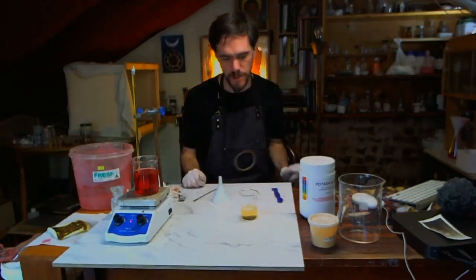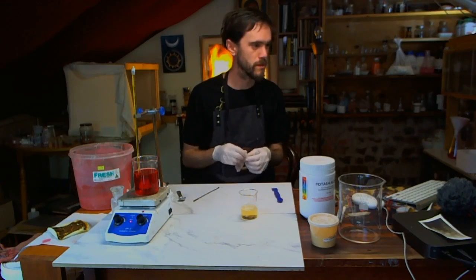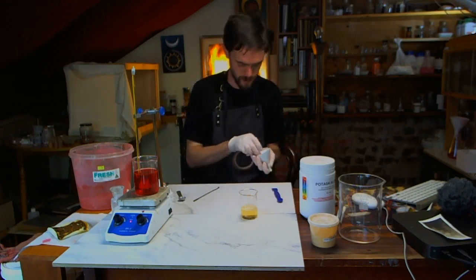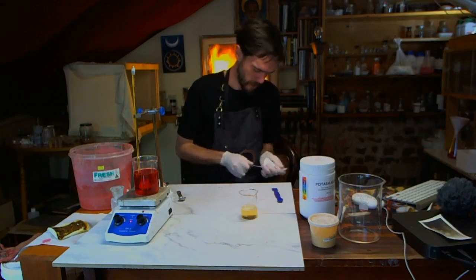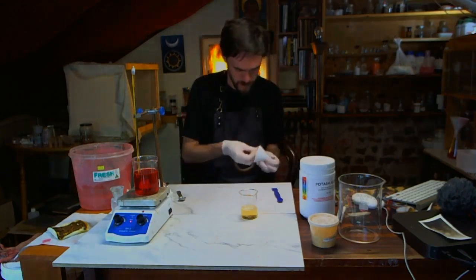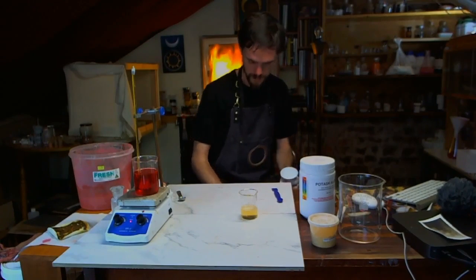All right, we're at 50 degrees. I'm just cleaning out this funnel. Acetic acid.